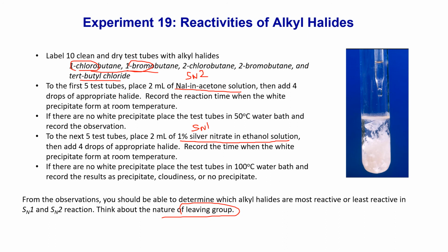So be sure to take down the observations and think it through, okay? After recording down all the observations, sit down and think through whether the alkyl halides are going through the Sn1 or Sn2 mechanism, okay?